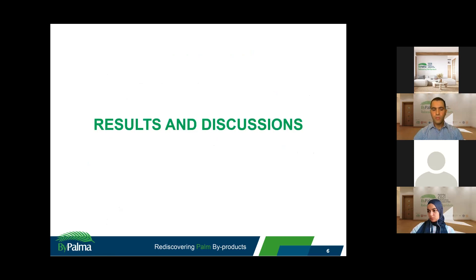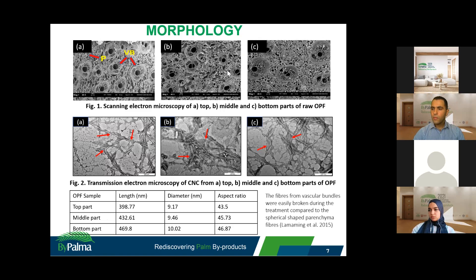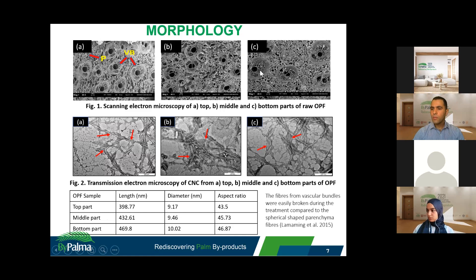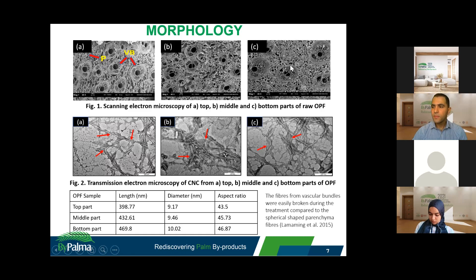Here are some findings of this work. The morphology of the samples was determined using SEM and TEM. Figure 1 shows SEM of the top, middle, and bottom parts of raw oil palm frond — this is the raw material. The vascular bundles are the round-shaped structures, surrounded by parenchyma. It can be observed that the top part of the raw OPF contains a higher proportion of vascular bundles compared to the middle and bottom parts.